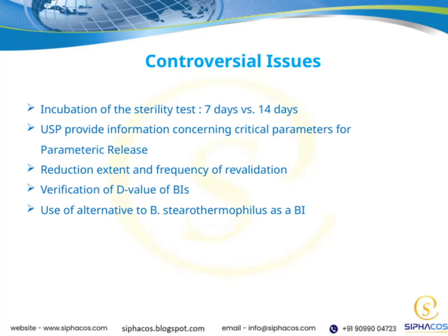Let's talk about the incubation period for the sterility test, specifically comparing 7 days versus 14 days. The longer period, of course, provides a higher assurance of detecting any contaminants, but it also extends the testing timeline. Balancing the incubation duration is crucial for efficiency without compromising safety.